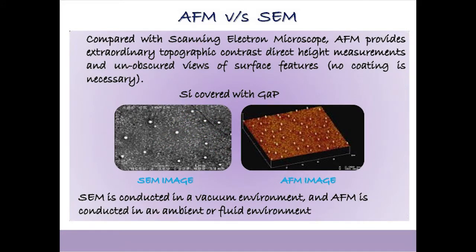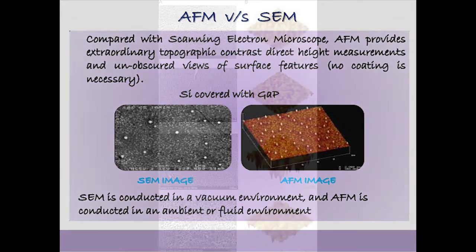While an electron microscope needs an extensive vacuum environment for proper operation, most atomic force microscopy modes can work perfectly well in ambient air or even a liquid environment. This makes it possible to study biological macromolecules, and even living organisms.